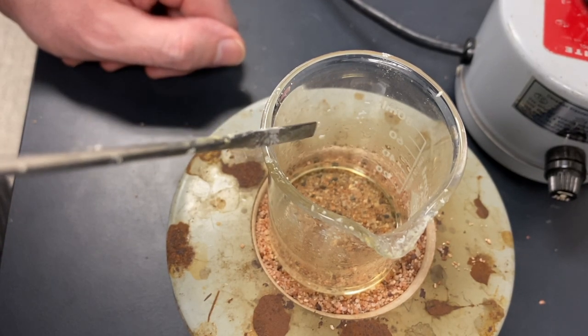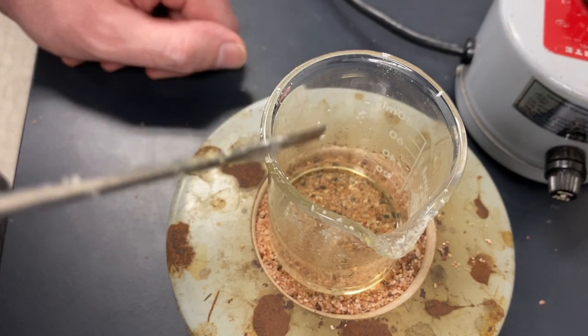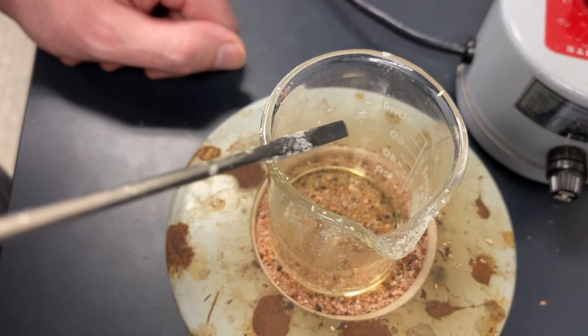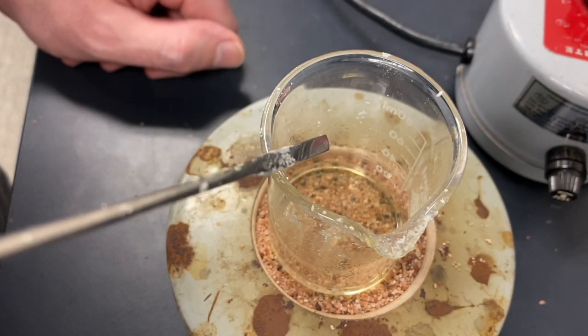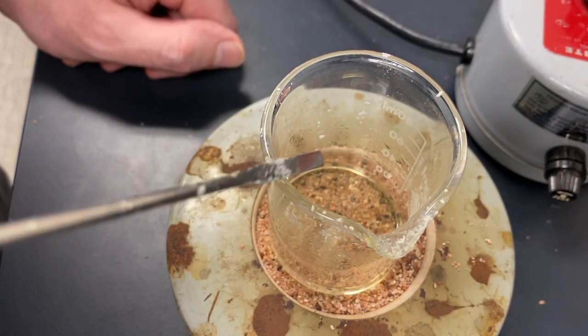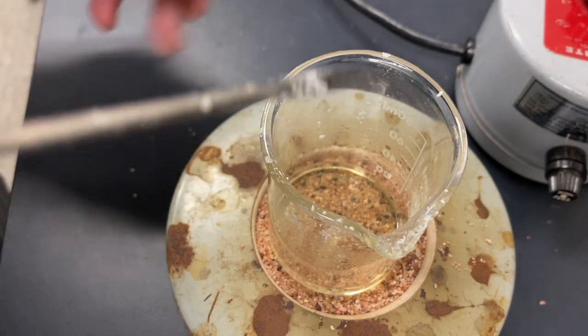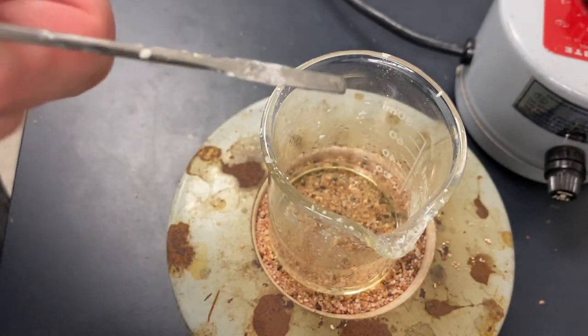If it seems like your product is not going to come out of the solution, you can add one or two drops of water to the ethanol solution. And that will help it crash out. But only if you're having trouble getting it back out of the solution.